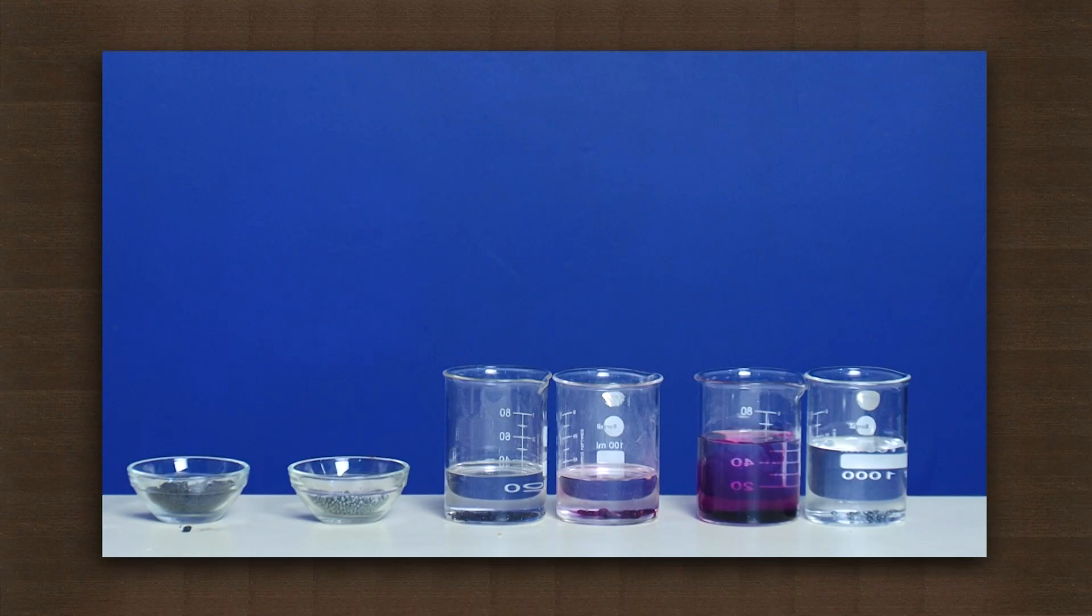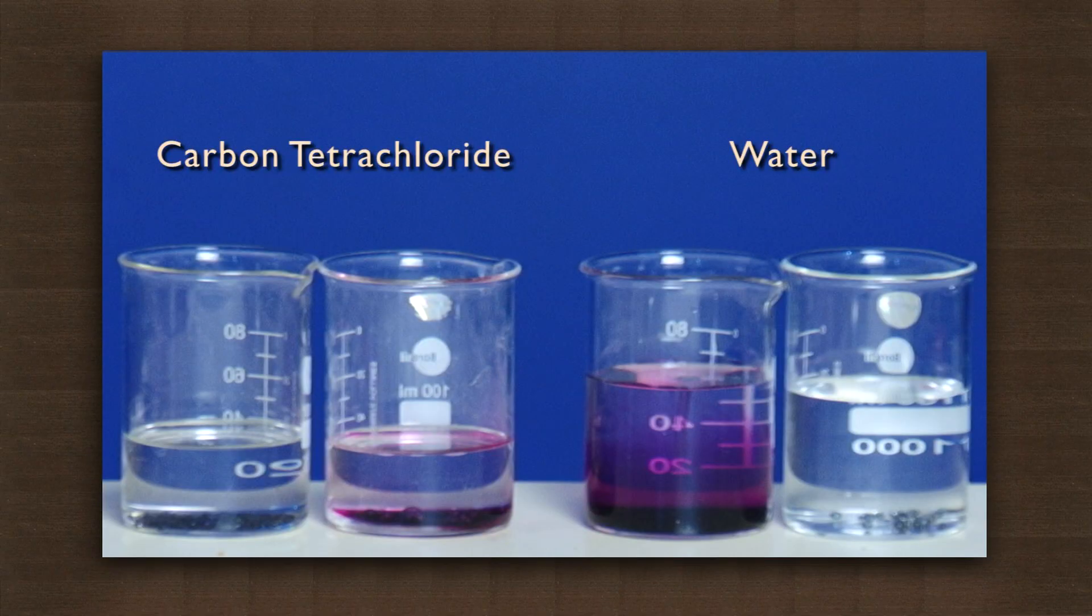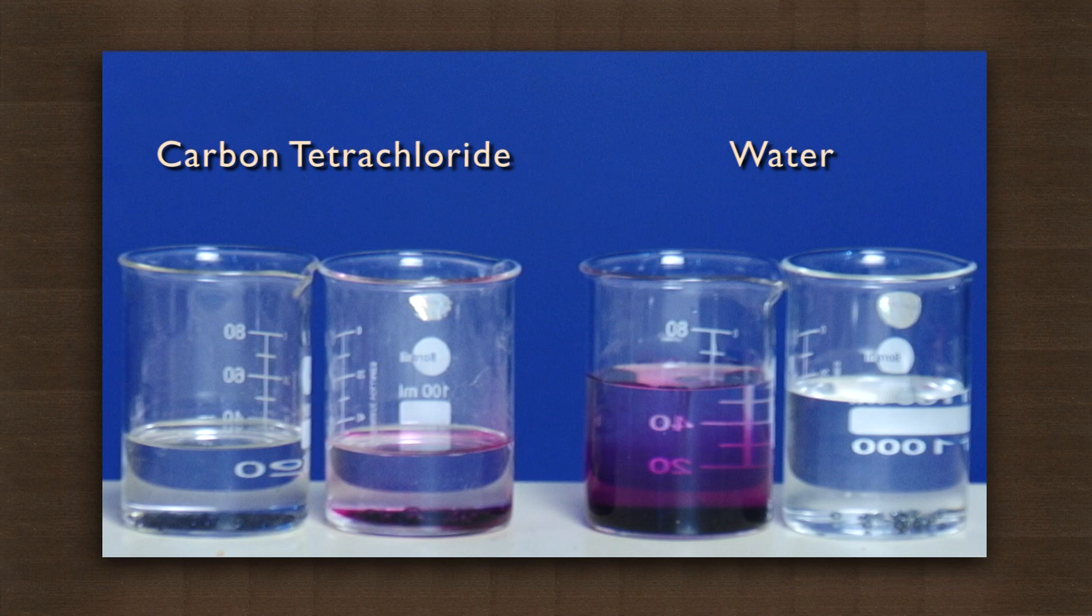Observe the colors in the beaker. The potassium permanganate crystals do not dissolve in carbon tetrachloride, but the iodine crystals easily color the carbon tetrachloride solution violet. In water, the potassium permanganate crystals readily diffuse and give a pink color, while the iodine crystals do not dissolve in water.